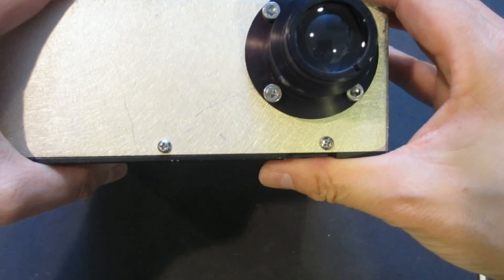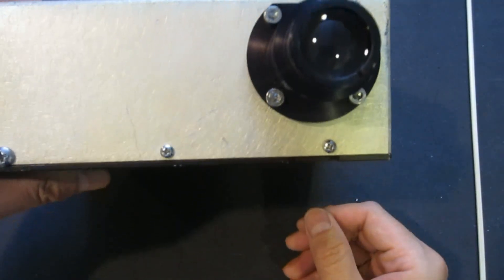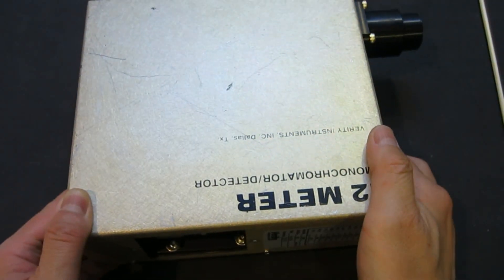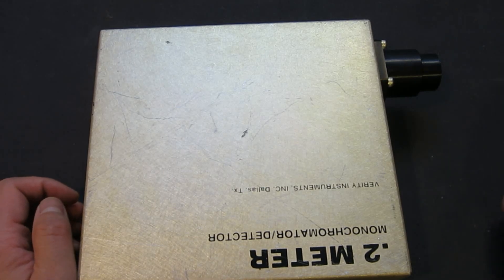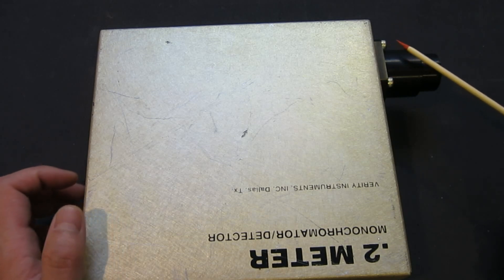Unfortunately, this type of slit is very hard to find at a reasonable price. So what I ended up doing was using some razor blades — those are very thin and very easy to manipulate. I cut them and formed a roughly 0.5 millimeter slit and put it in place. We will see a little bit how that slit performs.